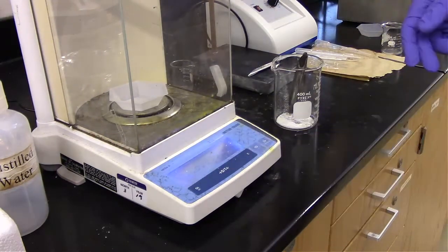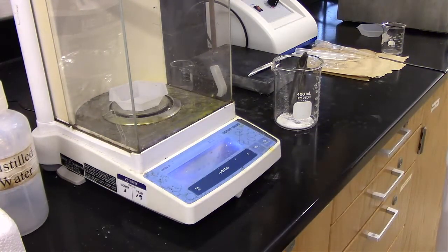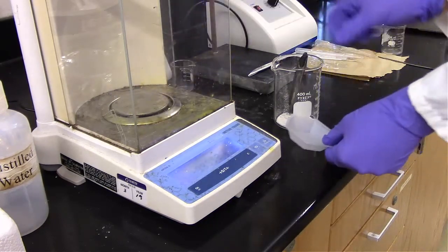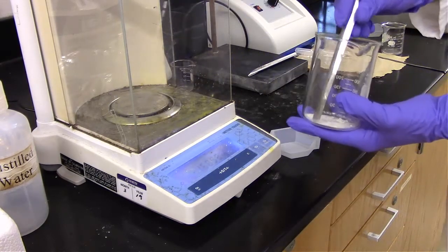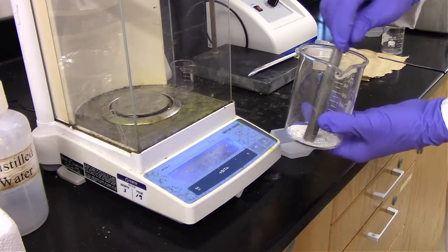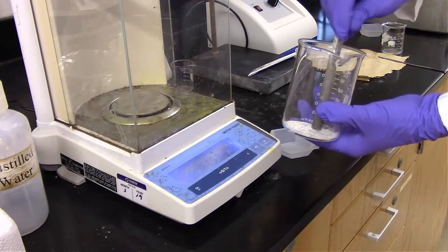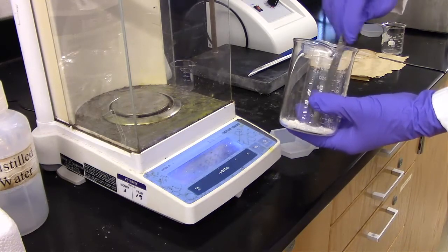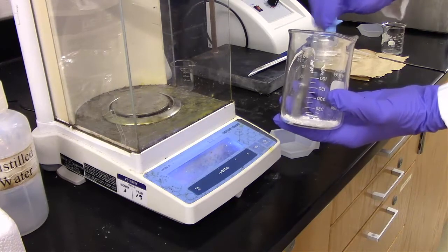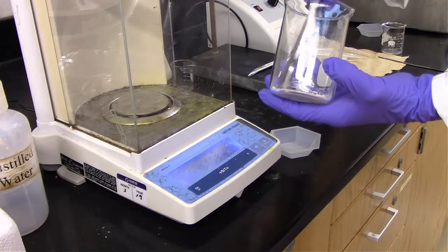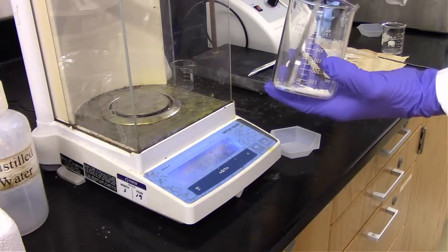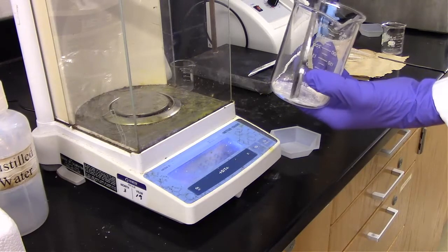And now after the potato was dry, I'm zeroing a weigh boat. And then we are going to scrape off all that starch from the bottom of the beaker. The starch is mostly dry, but it still adheres to that glass a little bit strong, which is what happens after you essentially heat it on an actual hot plate to dry it. We weren't too aggressive with the hot plate, but it is still a little bit sticky.